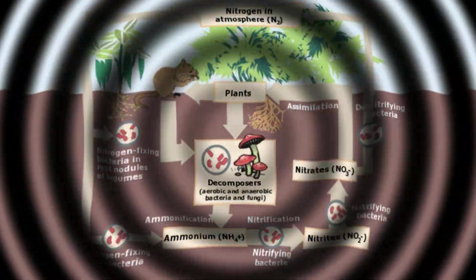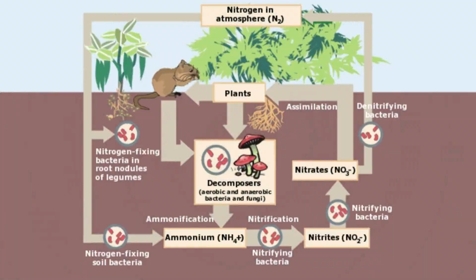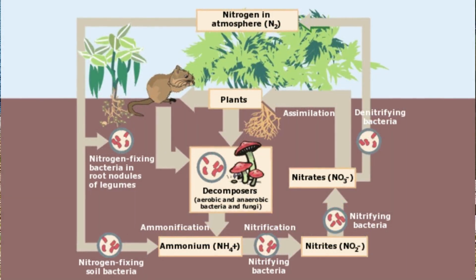The form of nitrogen we will be testing today is nitrates, as this is the form that plants use. The nitrogen cycle is complicated, but the best way to remember the form that plants love is that nitrate ends in 8, so just remember that plants ate it. The unit of measurement we're going to be using is parts per million, ppm. It doesn't take much nitrogen to fuel plant growth.